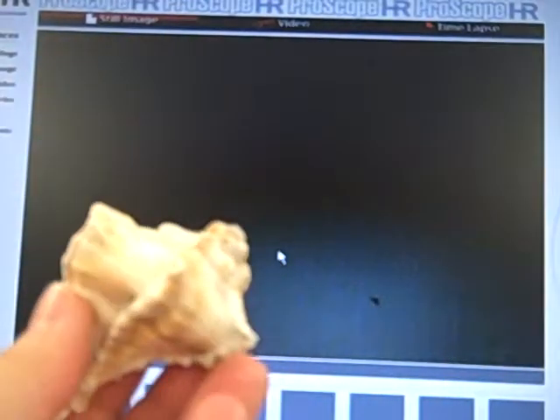I've brought also with me a leaf because we're studying plants and a seashell so we can look at different parts. It can be anything at all. Anything that's printed in color like newsprint or anything in books is fun to look at because you actually see that it's not just one color, it's different colors.